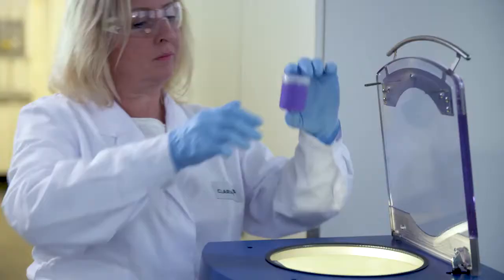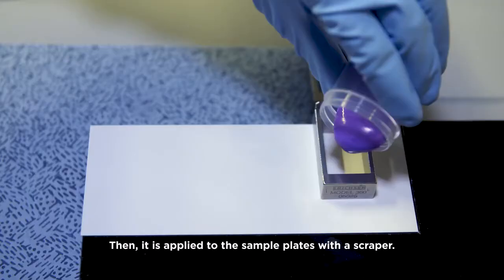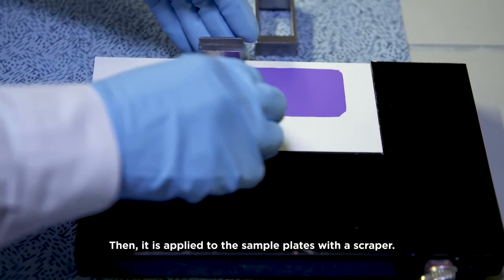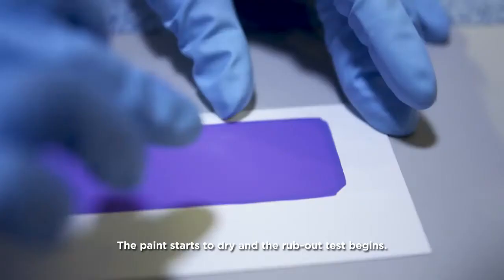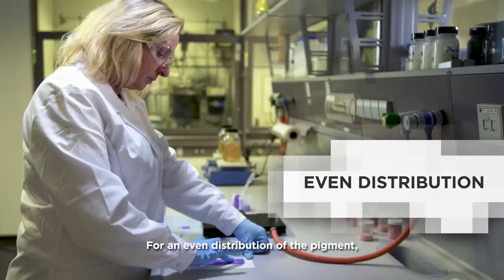Then it is applied to the sample plates with a scraper. The paint starts to dry and the rub-out test begins. For an even distribution of the pigment, thumbs or index fingers are used to rub circularly on the paint.